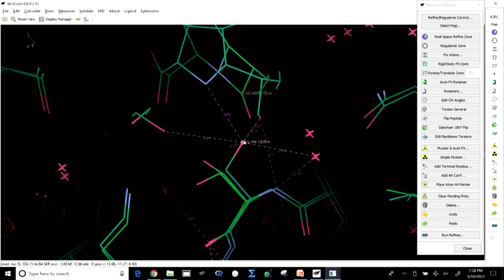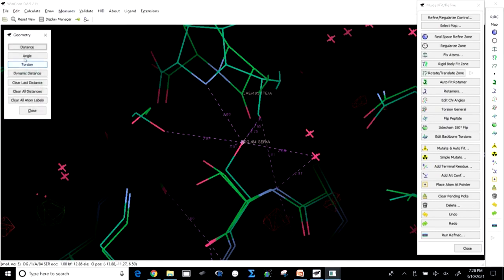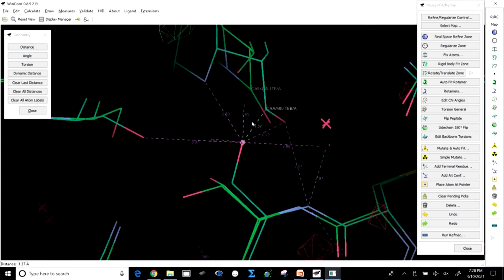So, this is near to the carbon, the distance is 1.37 angstrom, which clearly says that this has to be a covalent bond, but the other 2 serines are far away. The other 2 belong to the complex which does not react with the tebipenem.